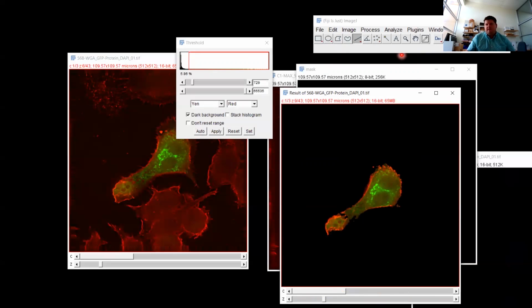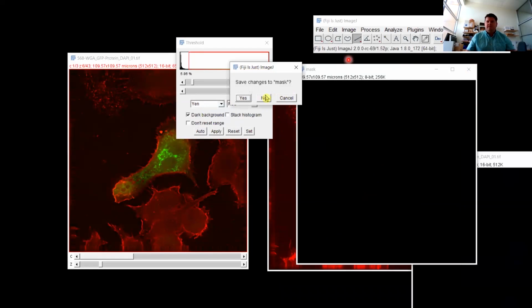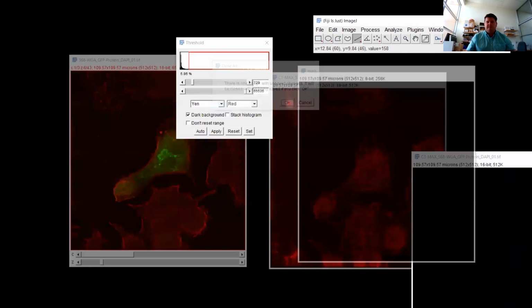Now it looks, I could probably dilate my selection or something. It depends on what my downstream application is. Perhaps I'm only interested in transfected cells that have taken up bacteria. So it doesn't look pretty, but it's sufficient to then move to the next step and then threshold in that little region and ignore all the non-transfected cells or something. So do it this way. Close all windows.